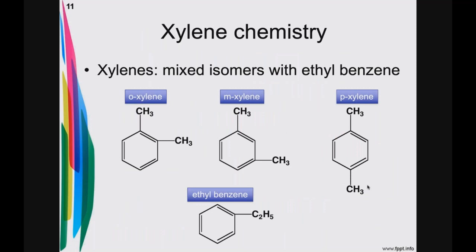So let's take a look at the chemistry of xylene, because we want to know what the xylene actually is. Because a xylene substitute, as its name says, it's a substitute for xylene. So what characteristics do we have to replace so we can continue to do our technical work the same way? So if you ever took organic chemistry, you know that xylene that we use in the lab is not really xylene, it's really xylenes. Because xylene can be in three different chemical forms. It's based on that ring structure, the benzene ring.